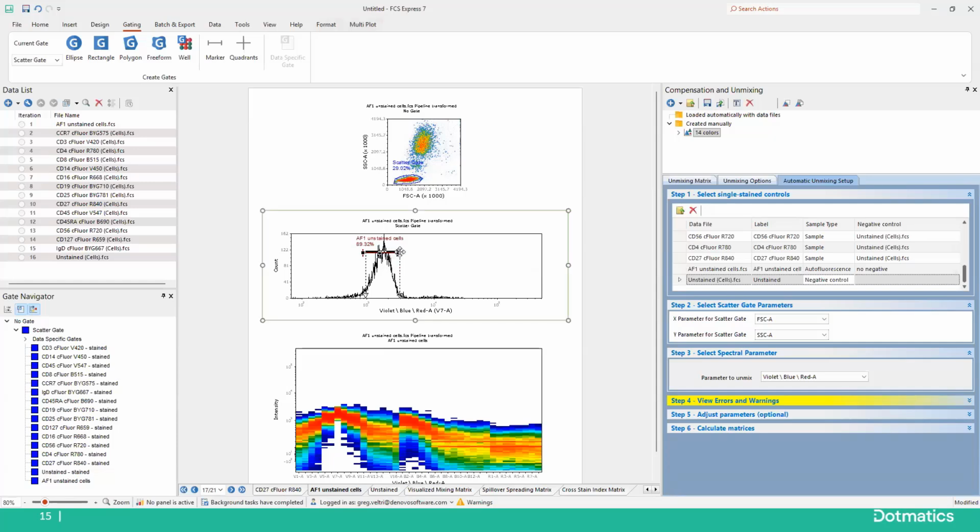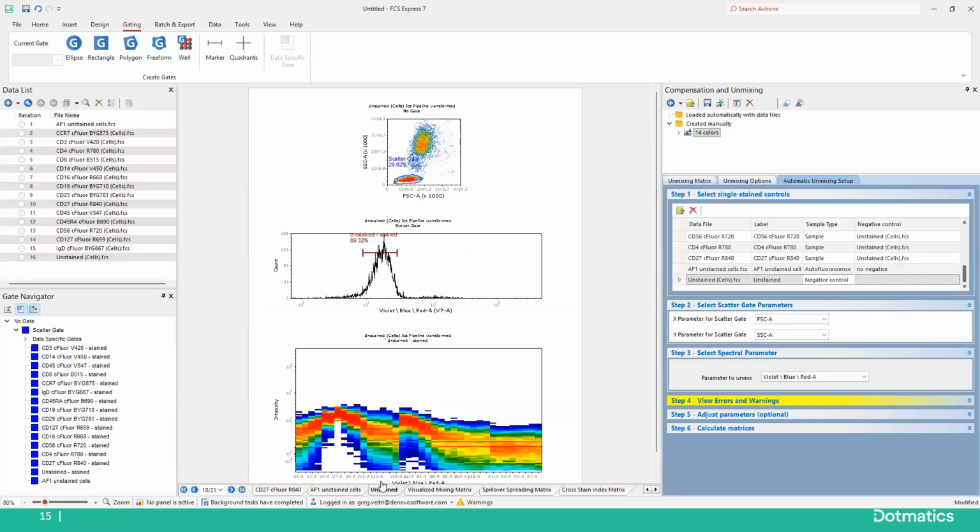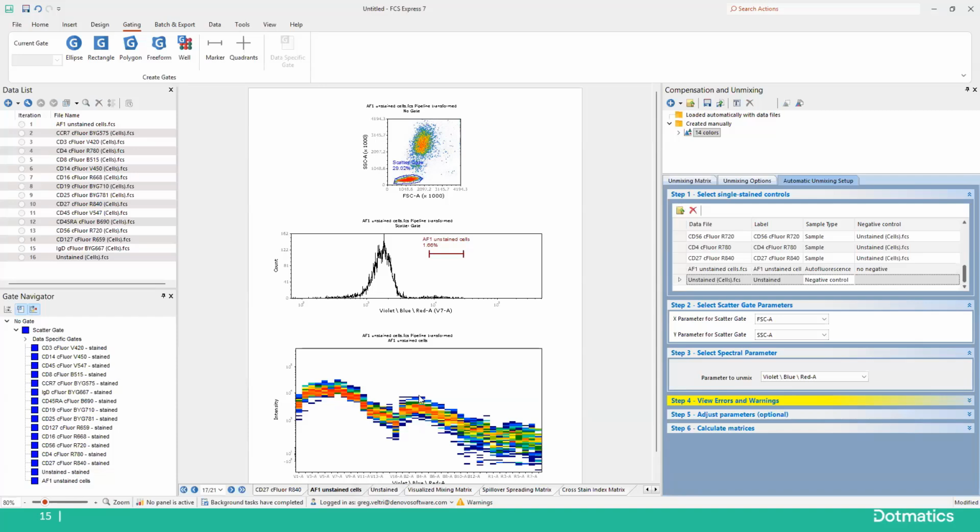But what I'm going to do is move it over here. Okay. Now, how do you know one autofluorescence is different than the other? It's the spectral curve that's going to help you. So if I look over here, it's basically the same, right? I've got a little peak here and a peak here, but when I go here, they're accentuated, and that's because the intensity is higher.